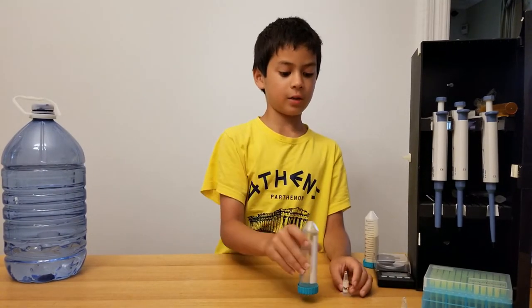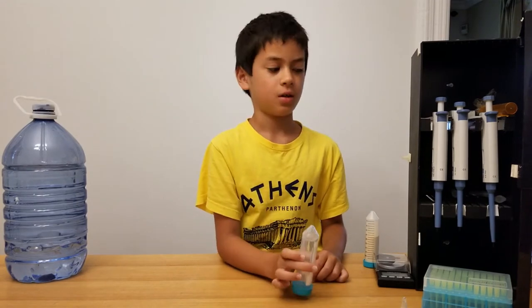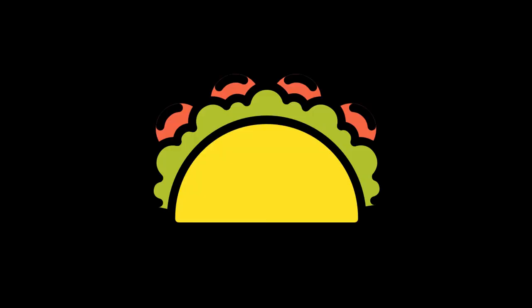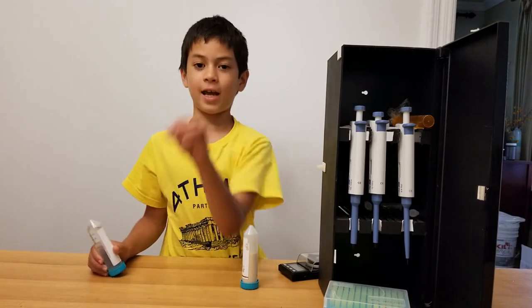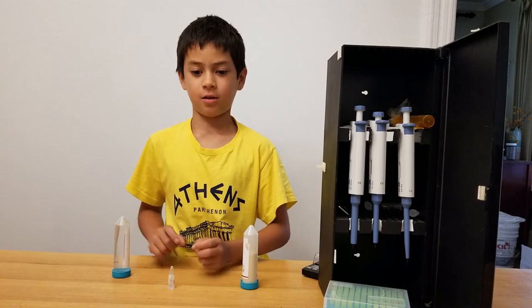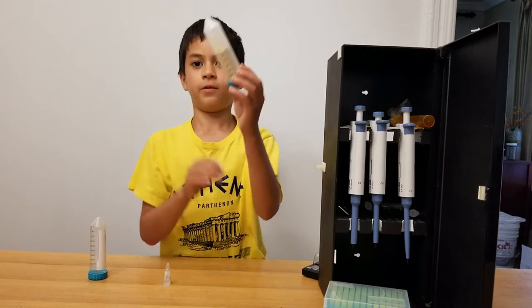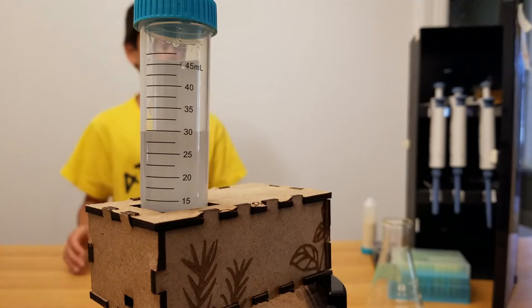Other common bacteria will die to it. We're gonna have to measure this carefully. The reason we have distilled water from earlier is because we're putting very little of the antibiotic, so we dilute it. We use a pipette to put it in. Now let's talk about everything we measure — only three things: 10 milliliters of water, 10 microliters of the antibiotics, and 0.37 grams of the LB agar.